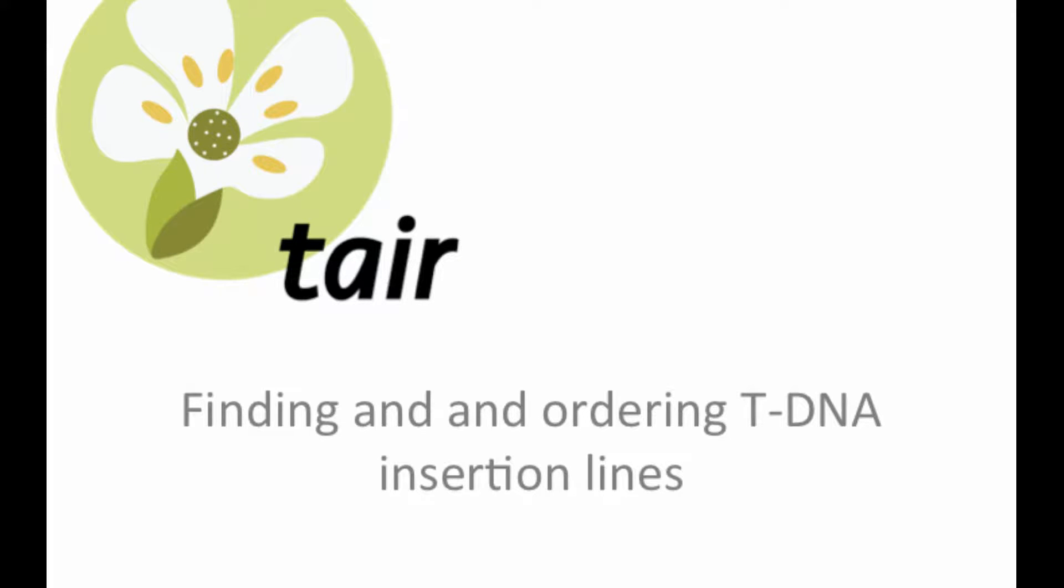In this brief tutorial, we'll show you how to understand and use the tDNA flank sequence data and TAIR to find and order insertions in your gene of interest.